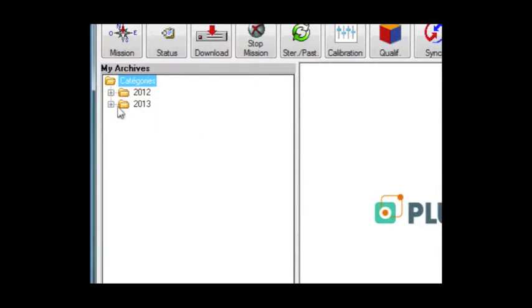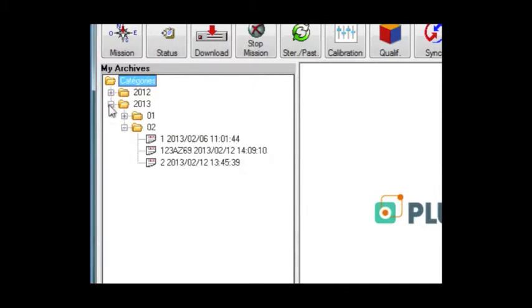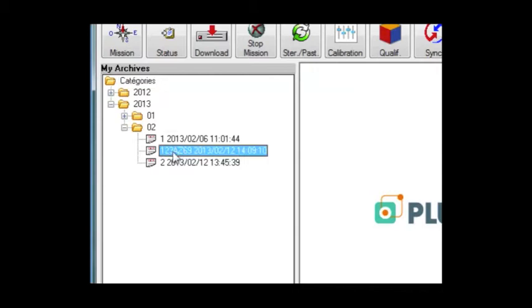Files are sorted automatically by year and month so you can easily find any archive in case of an audit.